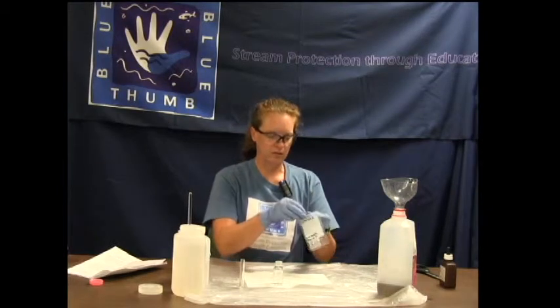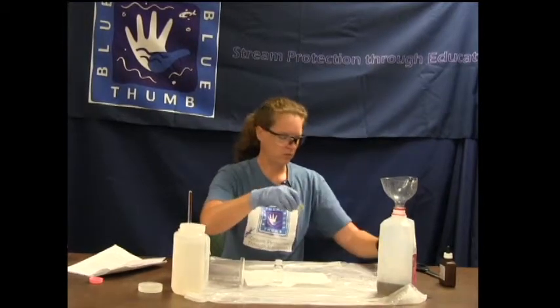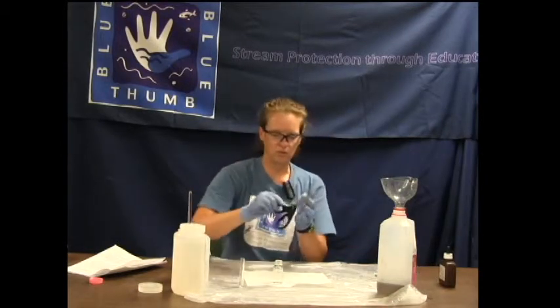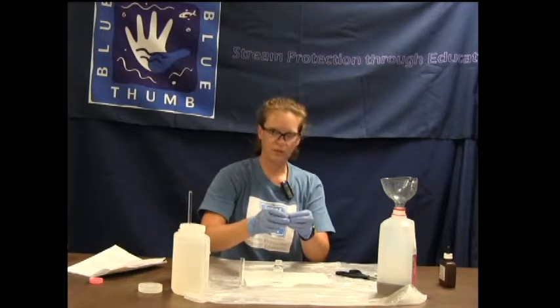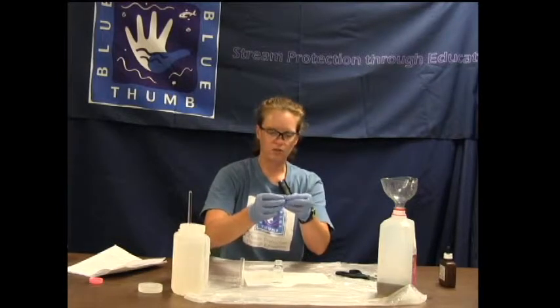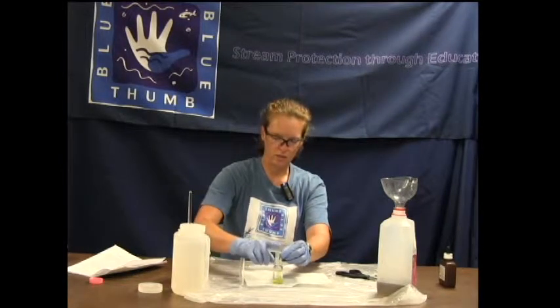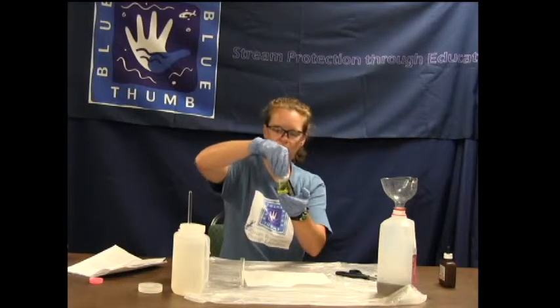We are going to start by adding the Chloride 2 powder packets — add one packet. Use scissors to cut the top off, and try not to poke your fingers or anything inside the packet. Just squish it open and add the chloride powder reagent to the bottle. Then swirl and agitate so that the reagent powder dissolves — it might take a couple of swirls.